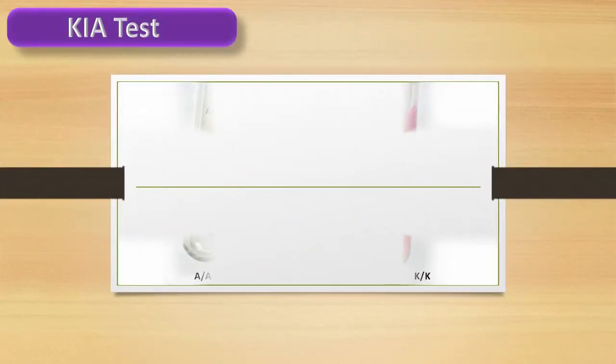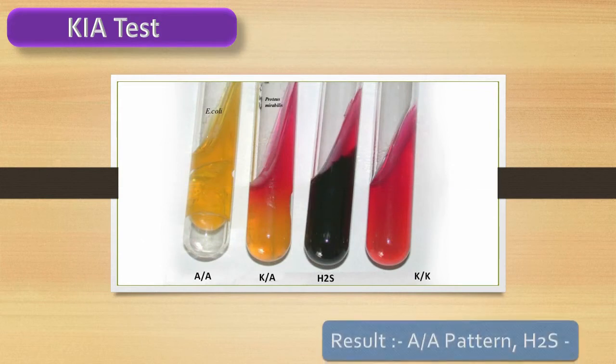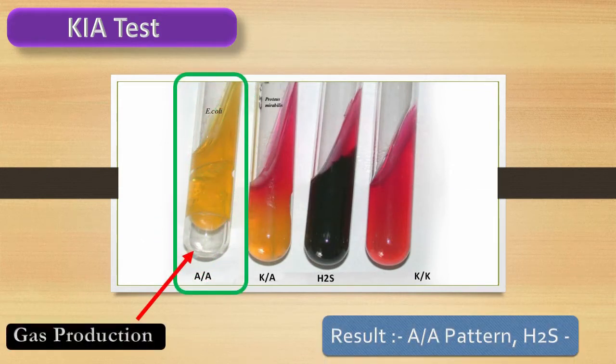Kligler Iron Agar (KIA) test: we can see the whole tube change into yellow color and gas production.